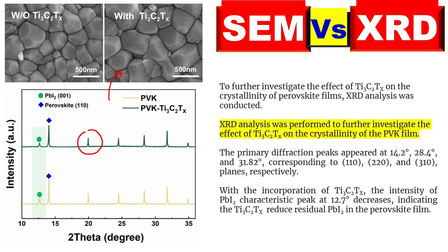Here we have two samples. The first sample is basically a pure perovskite film. The second sample is the same perovskite material, but with an additional material incorporated into the perovskite film. We can see that both samples have quality SEM images and both look great in morphology. In the pure perovskite, we have clear grains, while in the modified film the grain size increases.